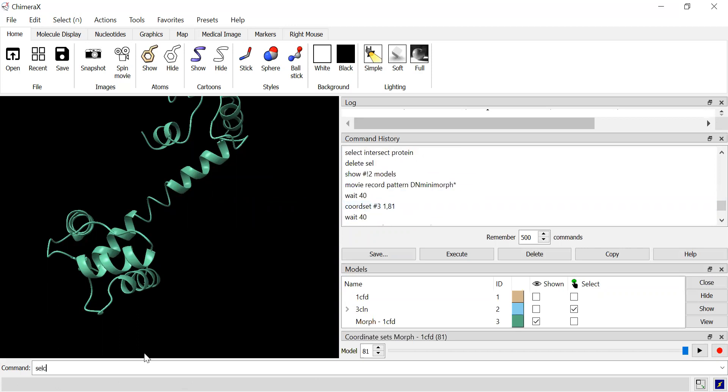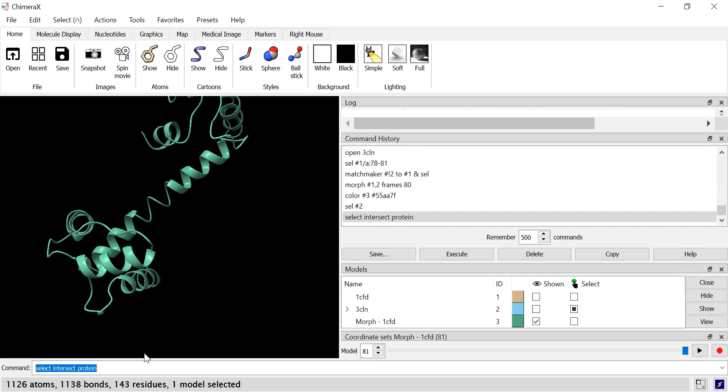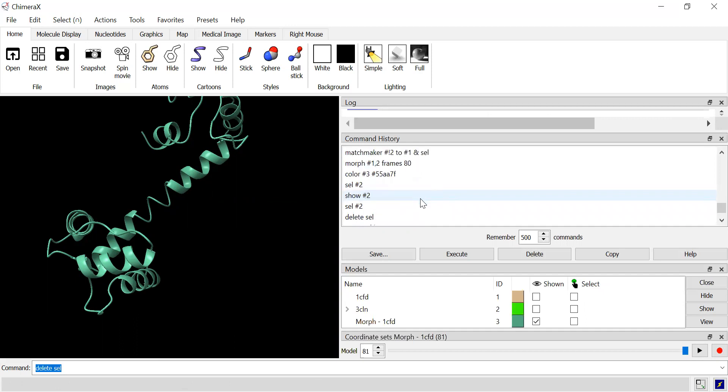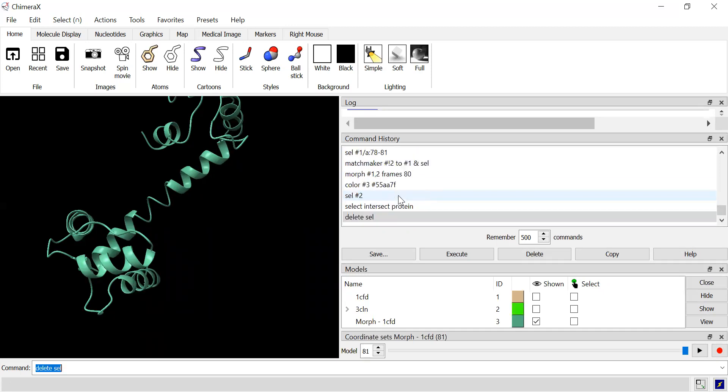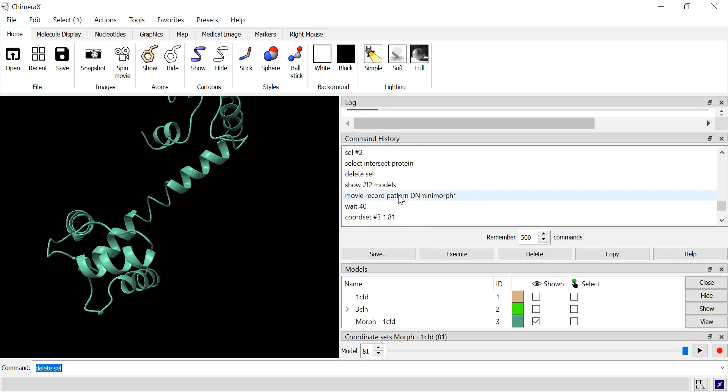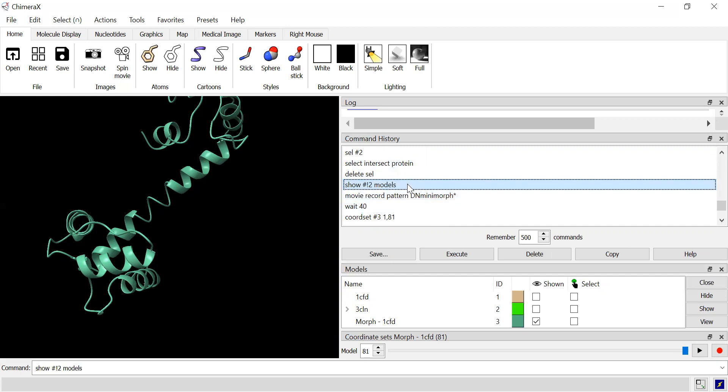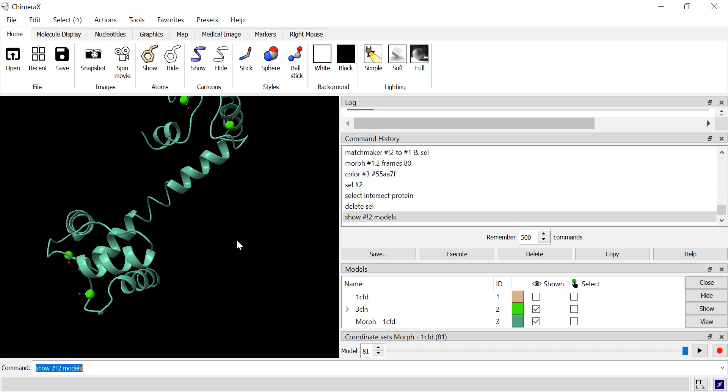But we're just going to specifically select intersect protein selection. And now I'll go through my original script to show the water. And there you go.